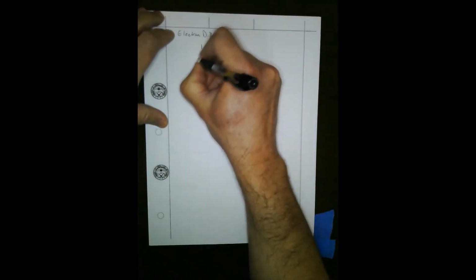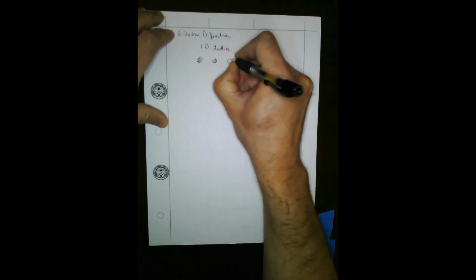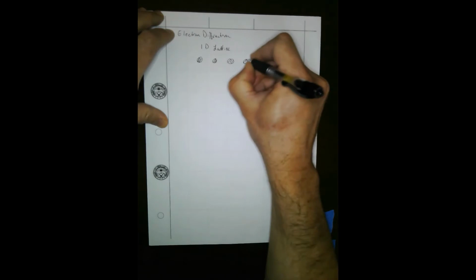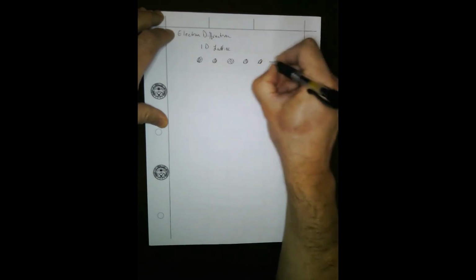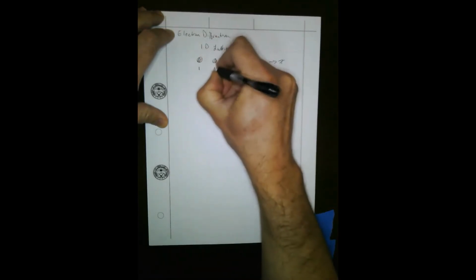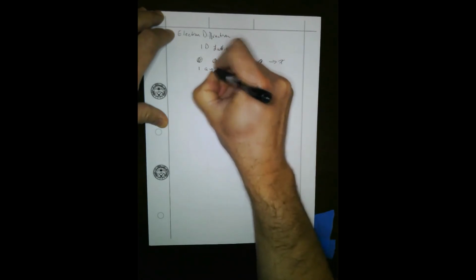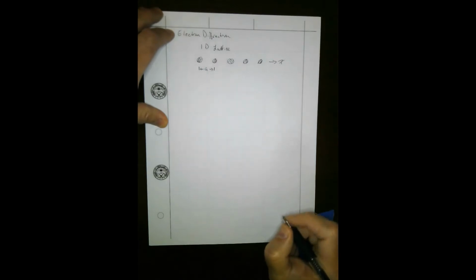We have our atoms in our lattice, expertly shaded, going in this X direction. They're separated by our lattice parameter a, which is a common concept.